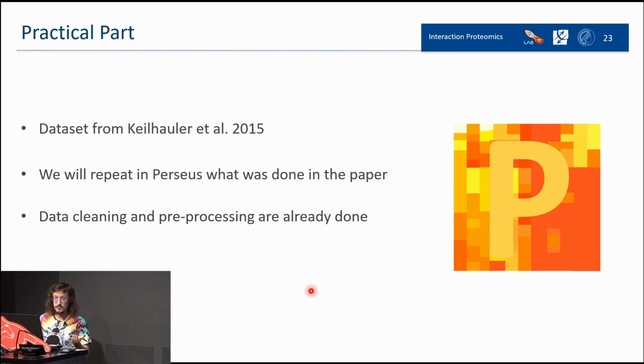As I said, there are 2 different sessions in the USB stick. This is the practical number 7. And you will have one session with the pre-processing done. We will open it now, that one, so we don't waste time during the pre-processing that you've done already yesterday. And also, if you miss something here, don't worry, because you also have the complete session, Perseus, where you can just open that and go through it again.